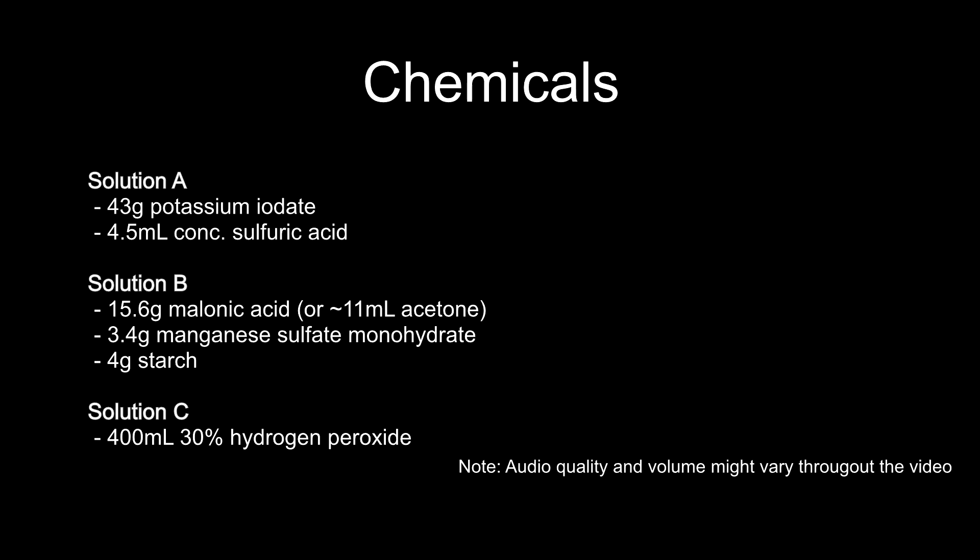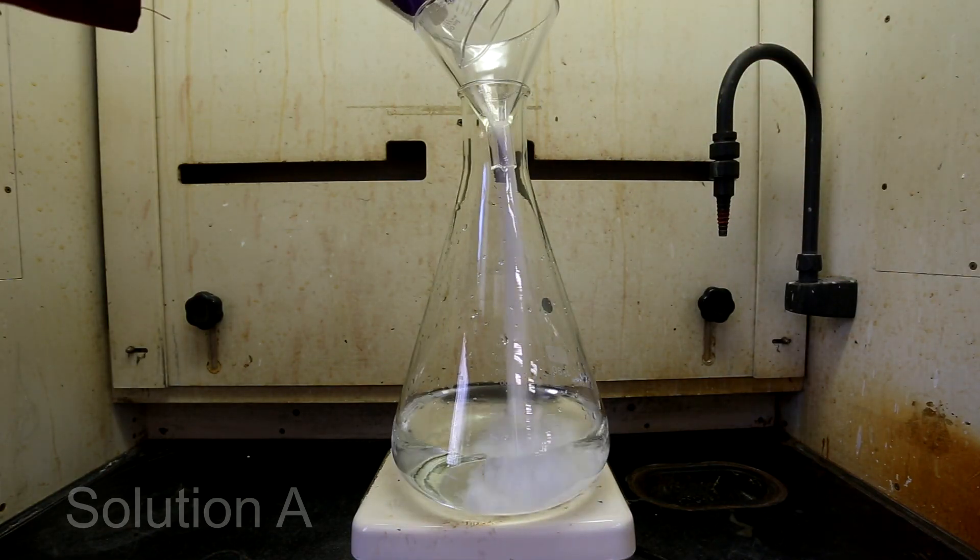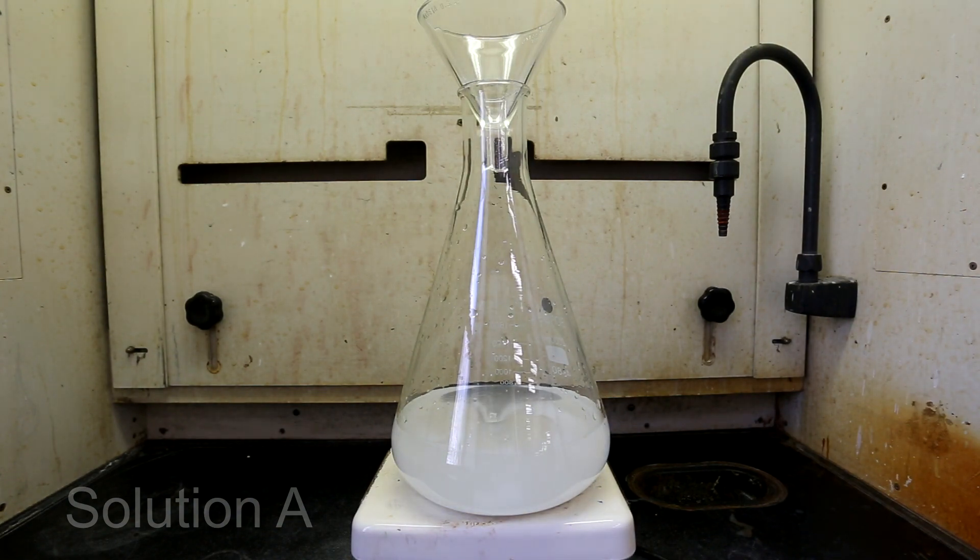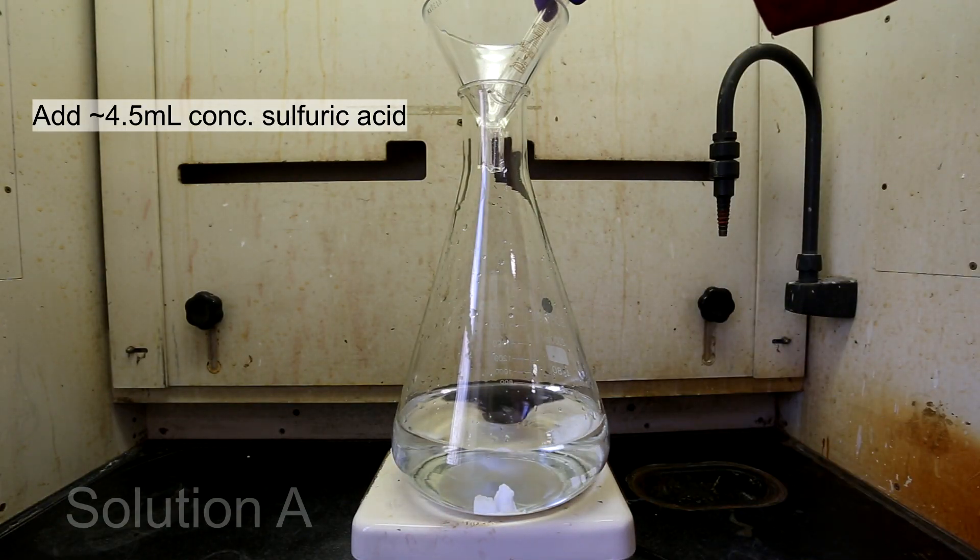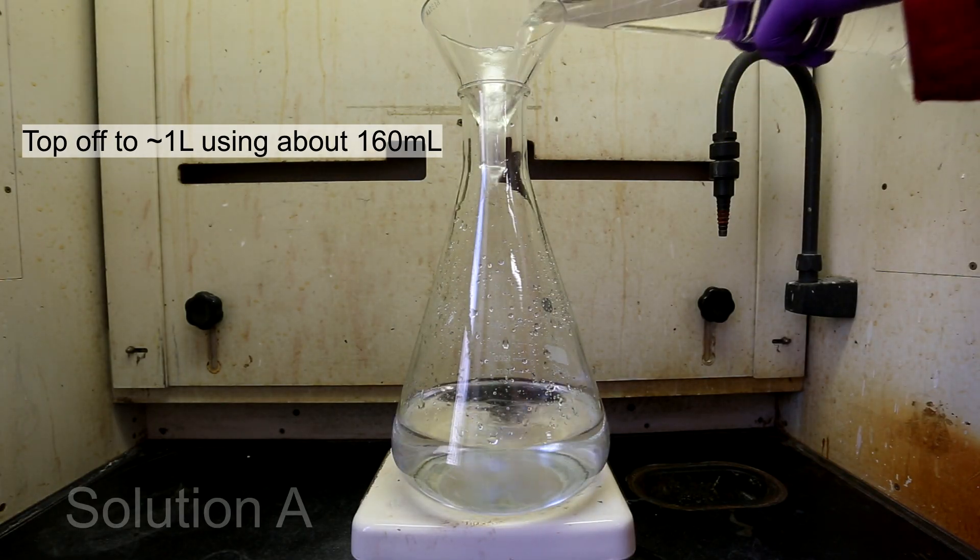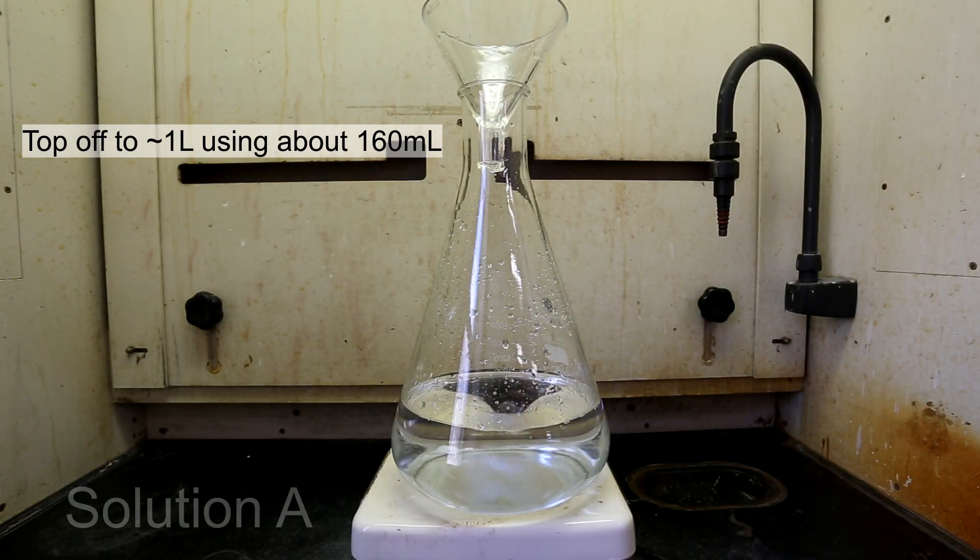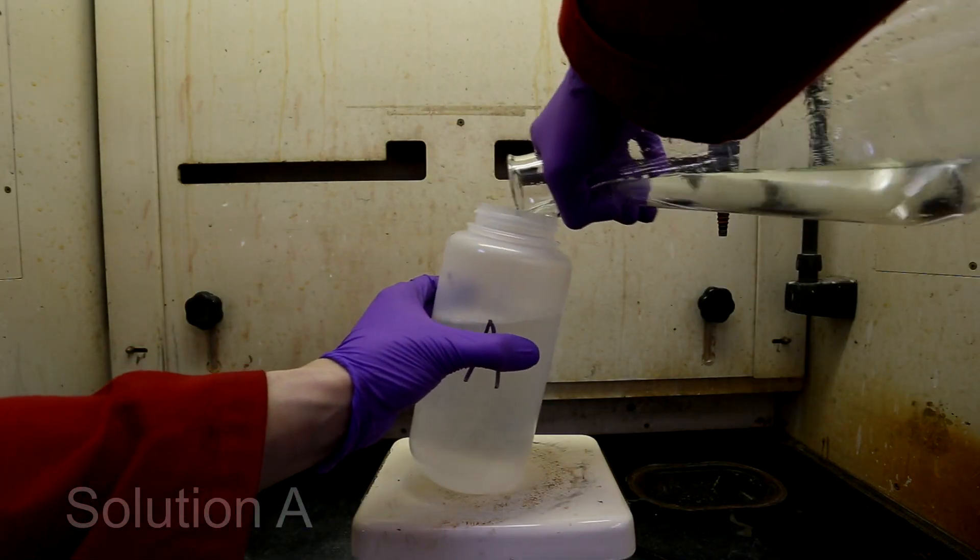I am now going to make the solutions in order starting with A. First, add 800 milliliters of water to an appropriate container, followed by 43 grams of potassium iodate. Stir the solution until almost all of the potassium iodate has dissolved. Next, add 4.5 milliliters of concentrated sulfuric acid. Stir until everything is completely dissolved and then top it off to 1 liter. The total volume does not need to be exact but try to get it as close to 1 liter as possible. Transfer the solution to an appropriate container labeled A.